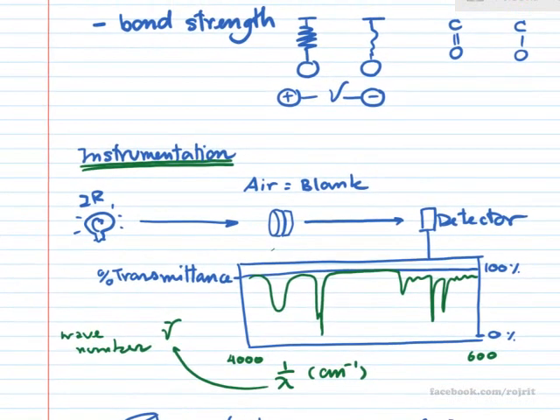Normally in organic compounds, we observe the stretching of the system between 600 and 4,000 wave number in reciprocal centimeter units. On the right-hand side is low frequency, low energy, and on the left-hand side the energy is higher and the frequency is higher.